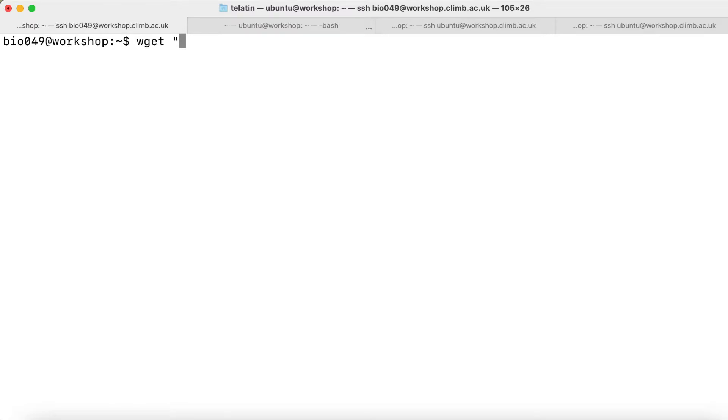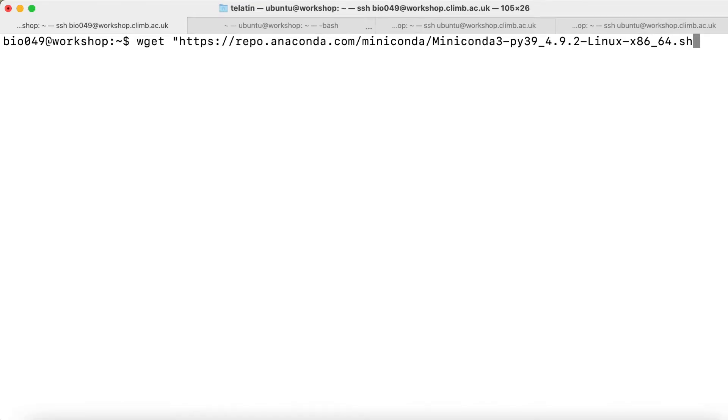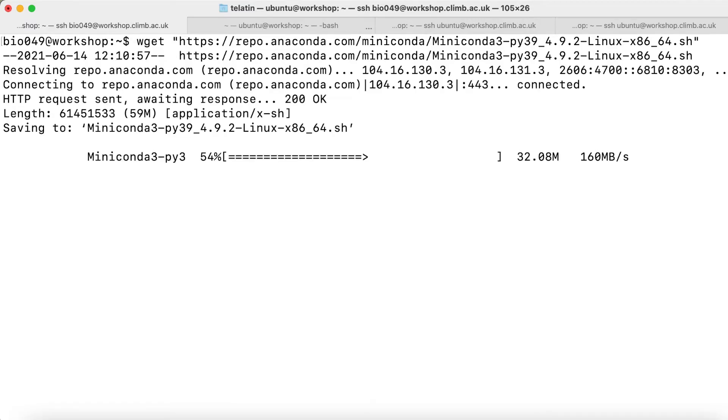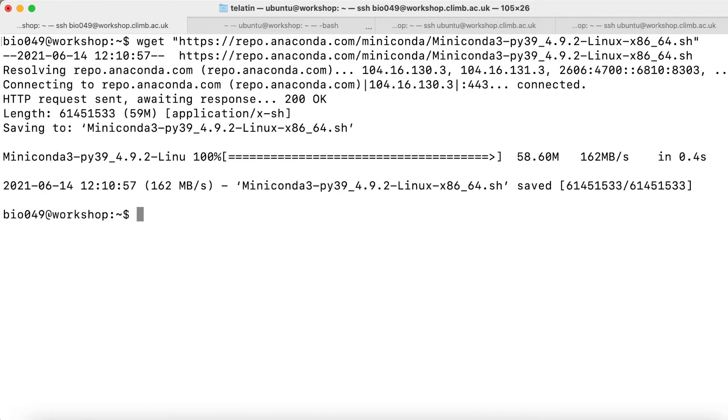I suggest you always put double quotes surrounding URLs because you don't know when you copy a URL if it contains some special characters that can drive wget mad. We download the correct package.